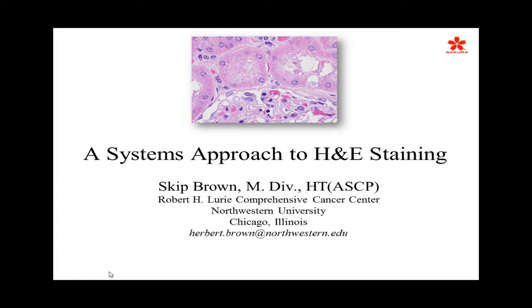What these things do is they have buffered reagents and the pH is maintained so that your staining run will give you consistency from first slide to the last. Oftentimes we don't look at the last slides. We review our first slide to make sure from a QA standpoint that everything is staining the way it should. But by the time you get up to 500 slides or certainly 1,000 slides, if we take a close critical look at that, you can see that some of the stain intensity has diminished. That's because just running that many slides through, the chemistries of those dyes and reagents has somewhat changed.